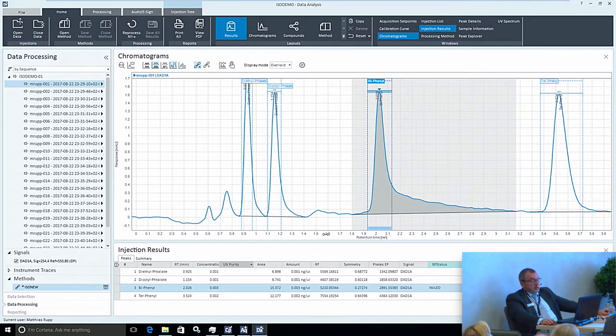What you may not see in the very back is those columns on the peak injection results will not only show me chromatographic results, raw results, it will also show me a column, this one, which I put over there. This is actually the calculated external standard amount as part of my method. So you don't need to run any screen report or paper report to see the final amount. You would see this amount on screen.